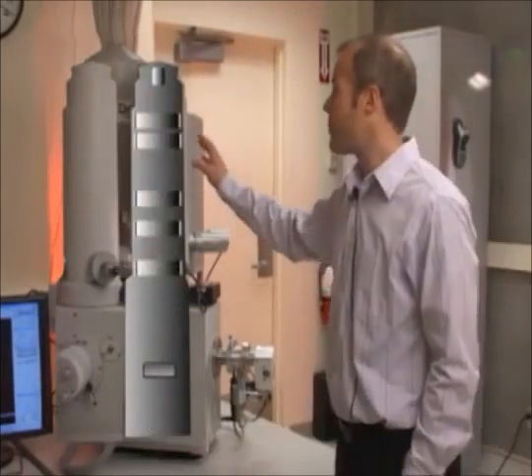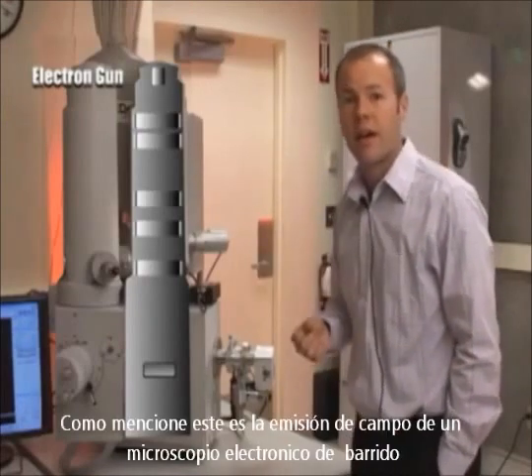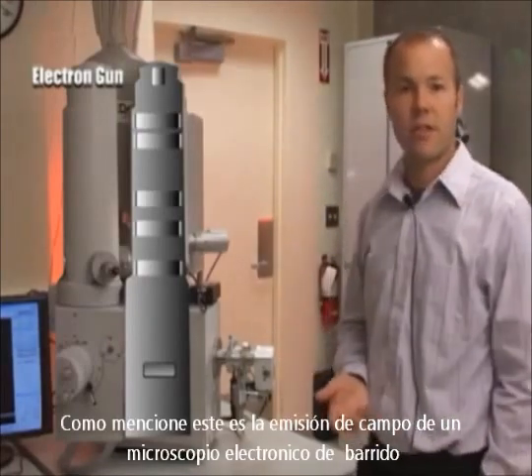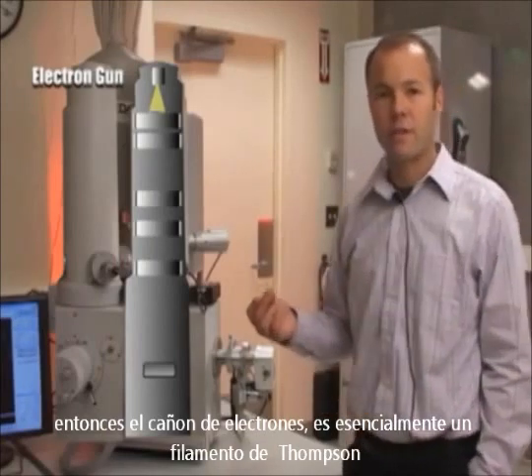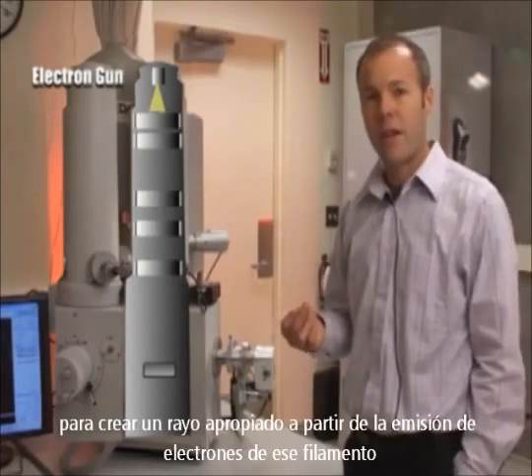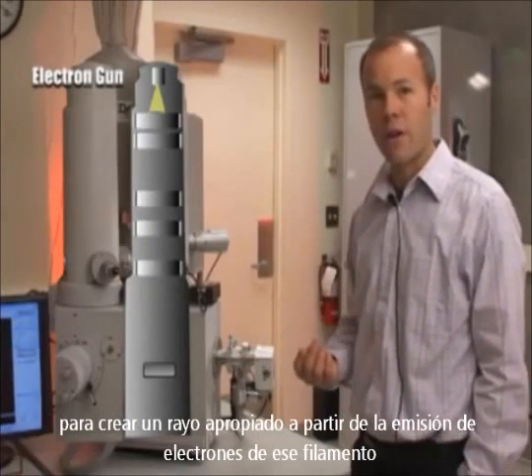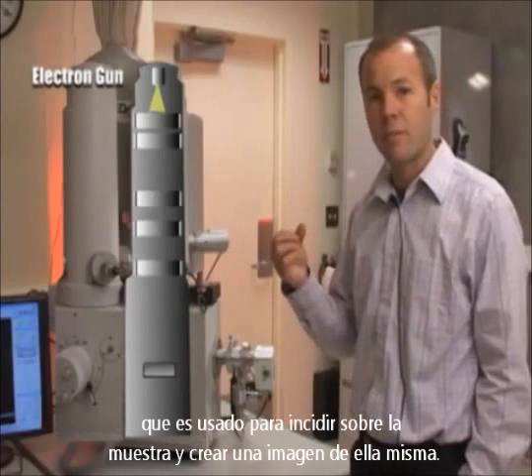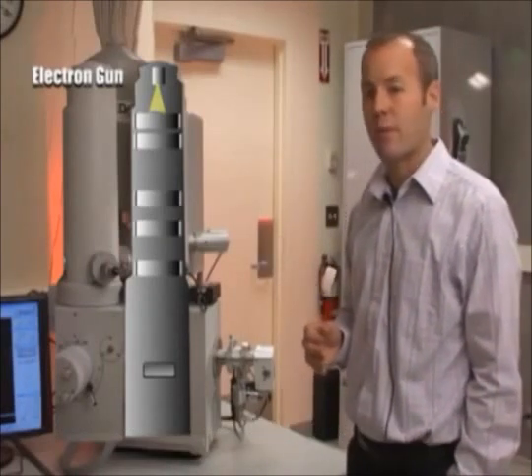At the top of the column in this section right here is an electron gun. As I mentioned, this is a field emission scanning electron microscope. The electron gun is essentially a tungsten filament — a very sharp filament. We use a strong electronic field to draw a current off of that filament, and that creates the probe beam that you use to impinge on the sample and image the sample.